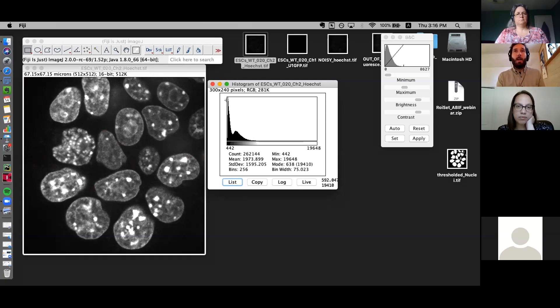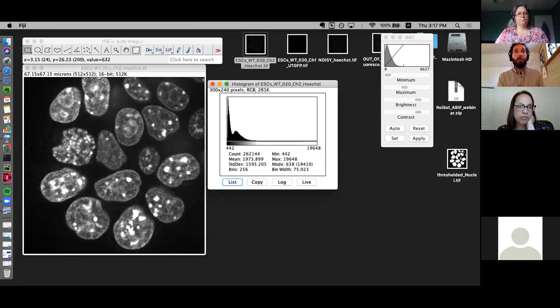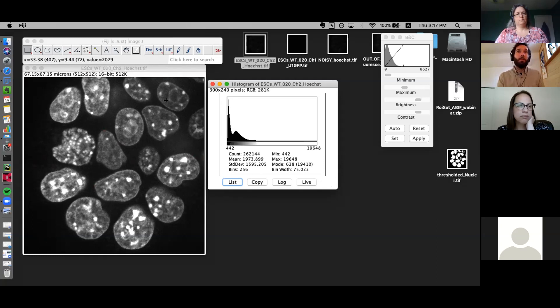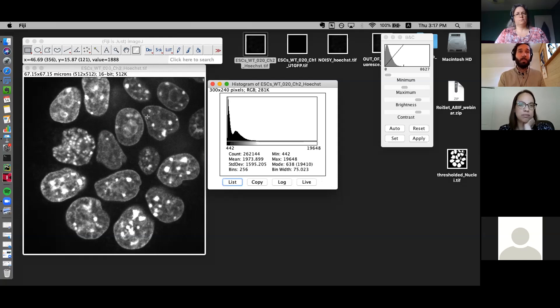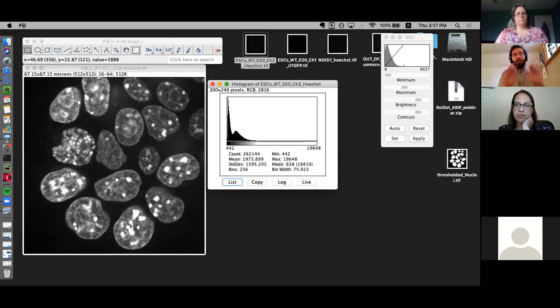Looking at the frequency: the background peak is around 500–600, and the signal peak is around 2,000. Sure enough, hovering over nuclei we see values of around 1,600–2,000. So we already have a kind of clear, visible definition between the background and the signal. This will be useful for thresholding a little bit later.